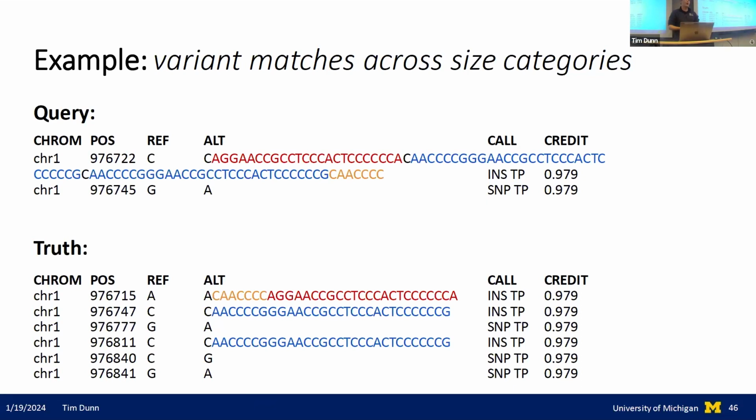So there, it would be possible, you're right, in some cases to use external data to try and go back and resolve and figure out what makes the most sense. But without doing that and just operating on the sequence information that you have, then you just need to choose parameters that reflect the relative likelihoods of those events happening and work with that, even though you're right, it's not perfect. Does that make sense? Yeah. Okay.